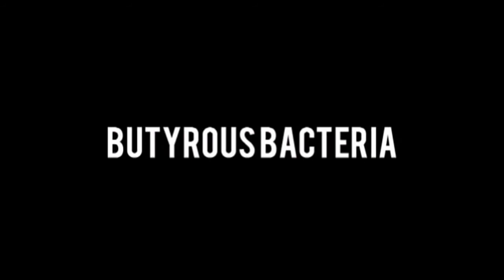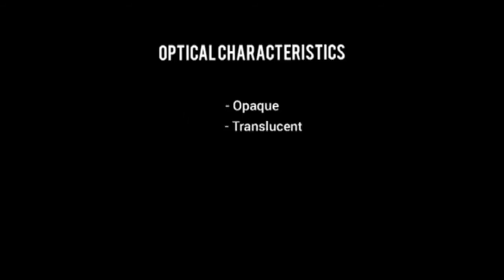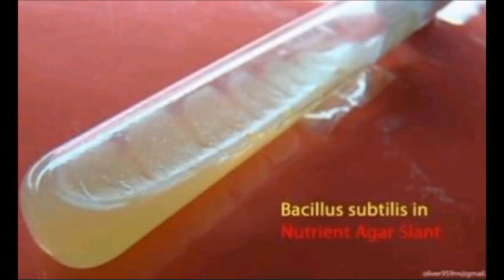Here in the category consistency, we have a butyrous bacteria. An example of bacteria is a Shigella. A viscid bacteria, an example is a Staphylococcus aureus. Optical characteristics category, there is opaque, translucent, iridescent, fluorescent, glistening. An example of a translucent bacteria, Shigella and Bacillus subtilis. Fluorescent bacteria is Aliivibrio fischeri.